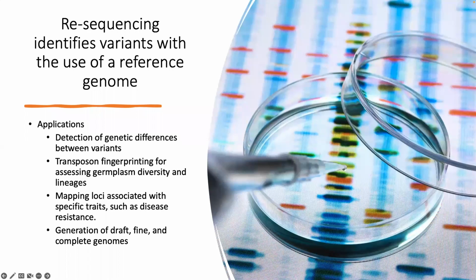So as I mentioned, whole genome sequencing and resequencing identifies these variants with the use of a reference genome. A reference genome is the standard consensus sequence that you use for an organism to call your reads against. Using this method, you can detect genetic differences between your variants.